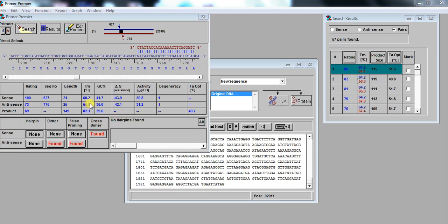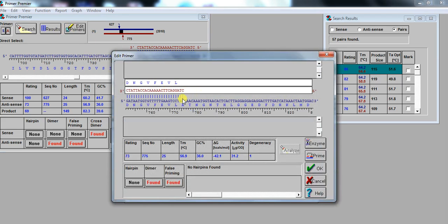To increase this temperature, we will add some bases in the primer. So it is primer, and then there is a C, and you can add the G and analyze. Its temperature is 60.4, but here at the 5 prime of the primer is G, and at the 3 prime side of the primer is C. Here is also a chance that they will pair with each other and affect the primer quality to anneal with the strand. So we can change this into another base, like here is a T, here is an A, so its complementary is T, and then analyze.